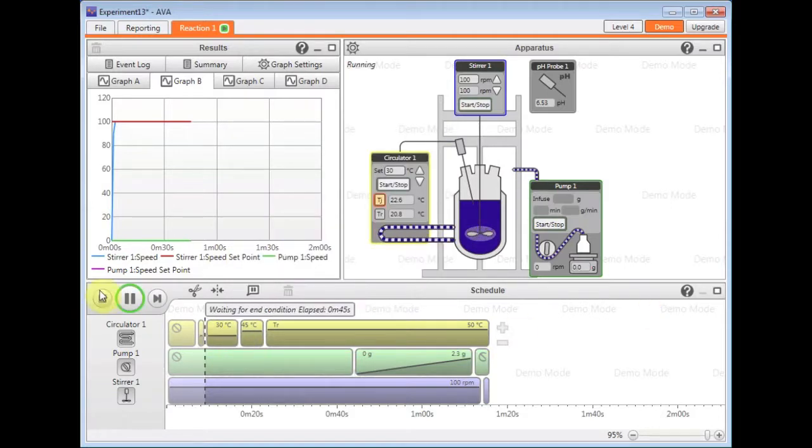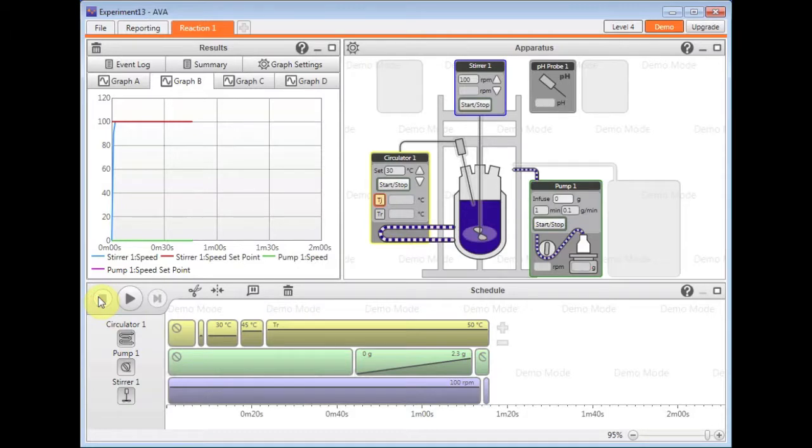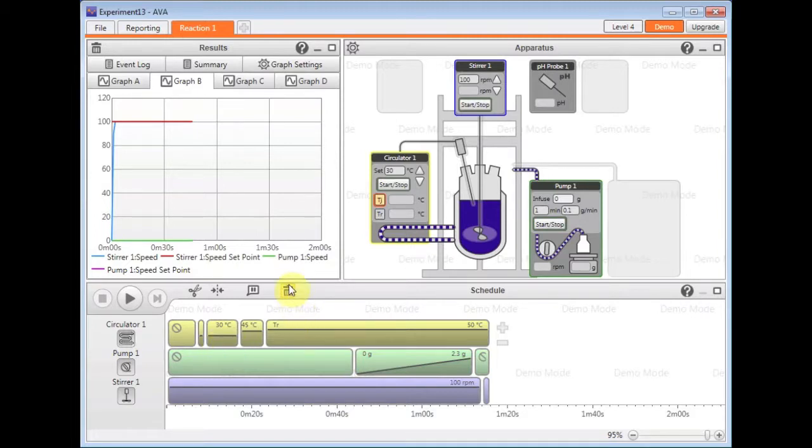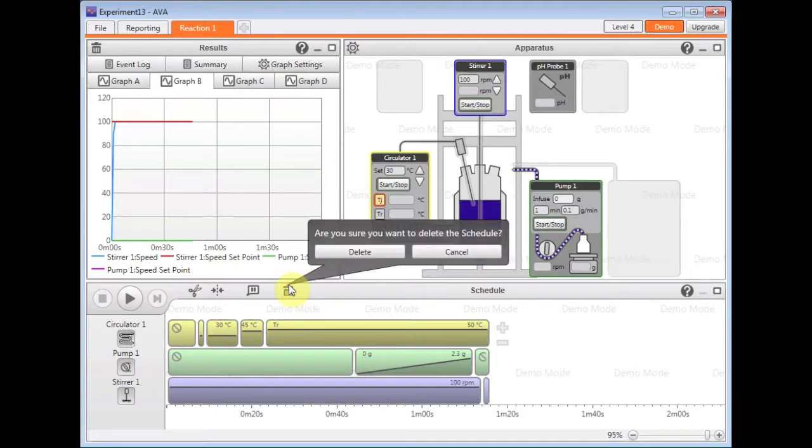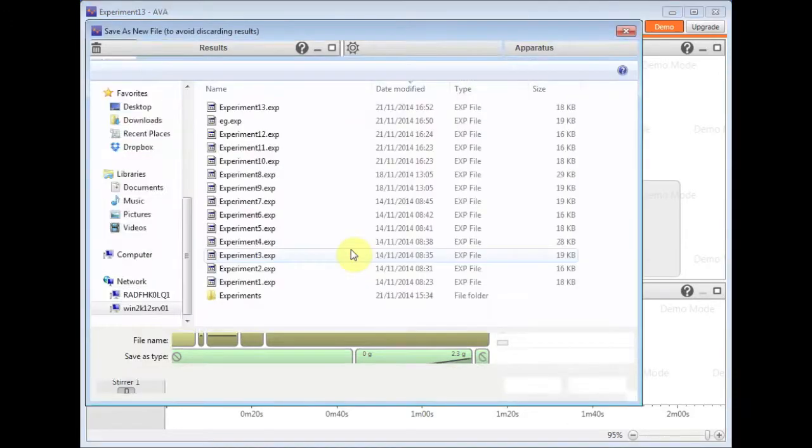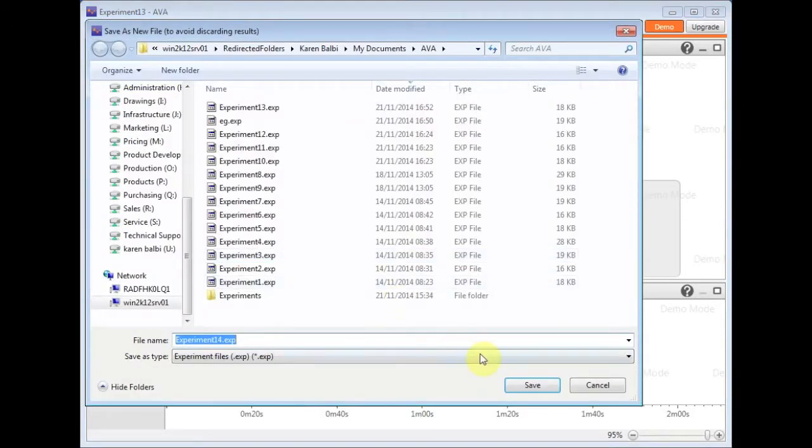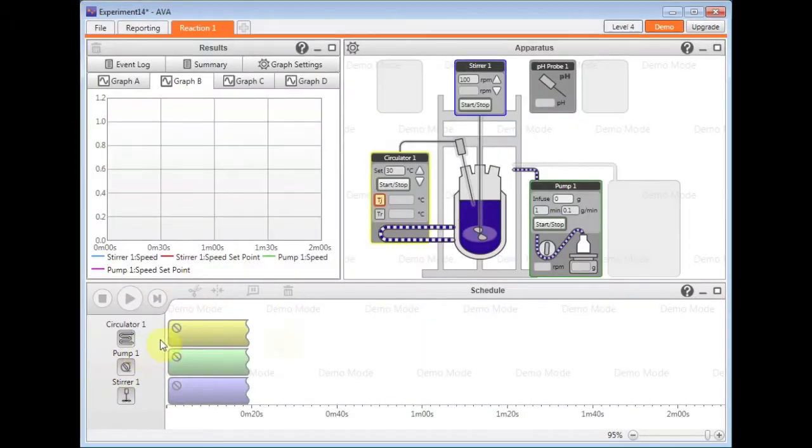So now I'm just going to stop this running. Another approach you can have is to actually create a schedule from scratch. To do so, I click on the delete button on the schedule. Just apply that delete, a new experiment name of course.